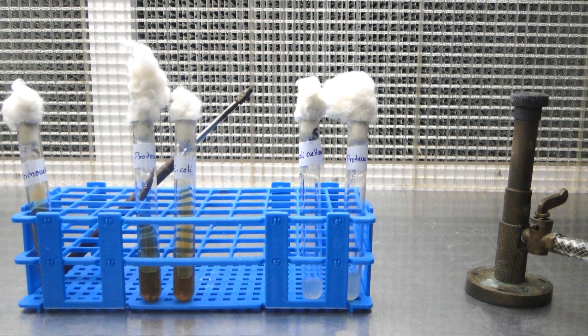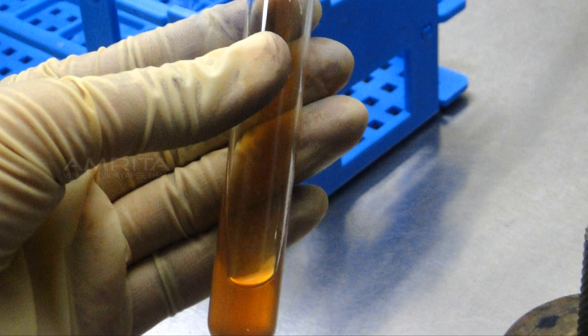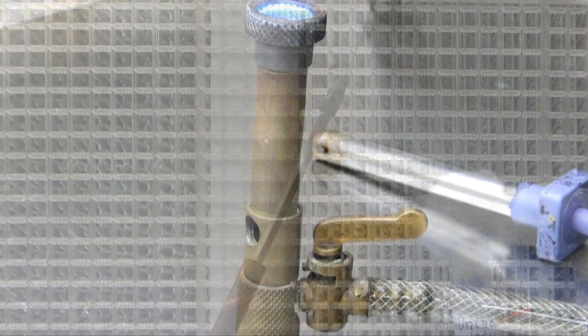Materials required: 24 to 48 hour tryptic soy broth cultures, urease slant, Bunsen burner, inoculating loop, and test tubes.